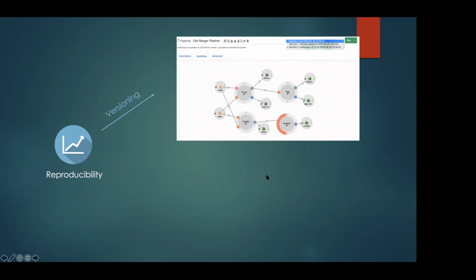In 3 years, he ran lots of samples, but with just a single pipeline we ran all these previous files with the new pipeline, and then they became standard. And then he finished his analysis again, and published his data like that with the new annotations and the new pipeline. So this will help you a lot in the future.